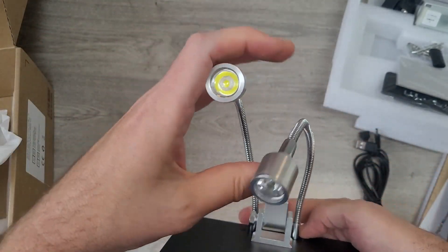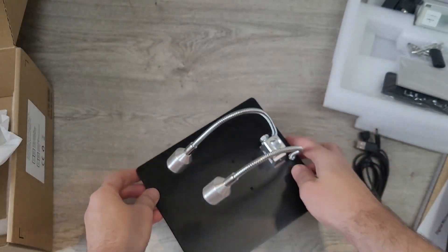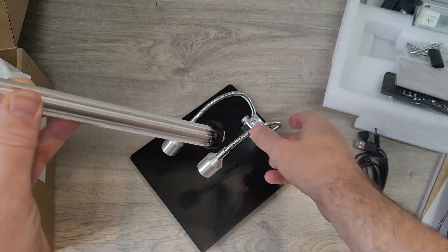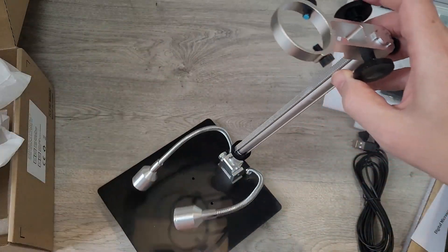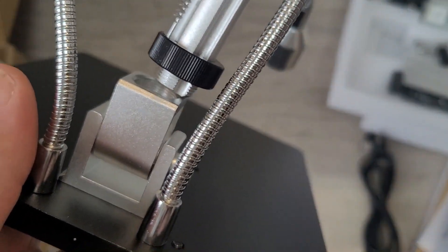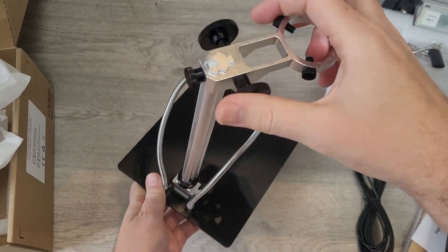There are two nice big LED lights on the top for when you're doing your work. The back pole simply screws into the back with a couple of turns, and then you adjust the small adjuster at the bottom to make it central.